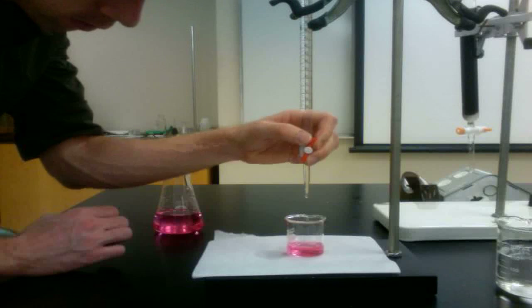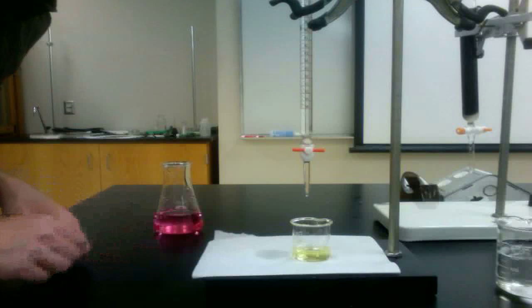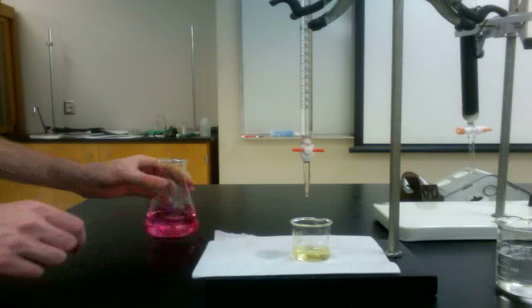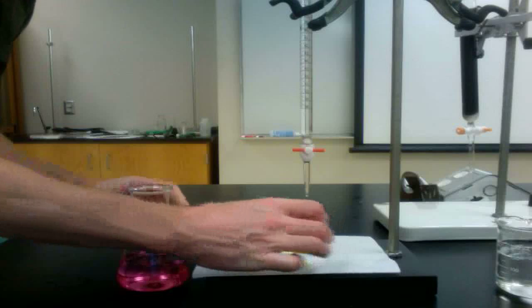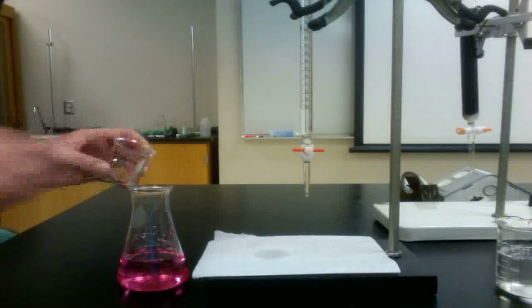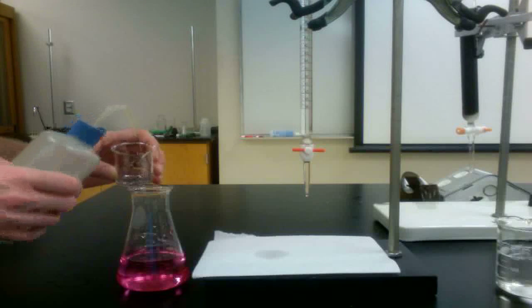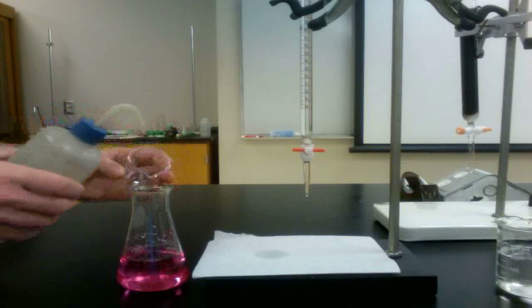When a fraction turns yellow with the addition of a drop of base, it has passed the test. This indicates that all the acid has been removed from the column and the titrations can proceed. Before starting the titration, add the fraction of effluent that passed the test to all the other fractions. Remember to rinse the beaker thoroughly to ensure that all the solution has been transferred.